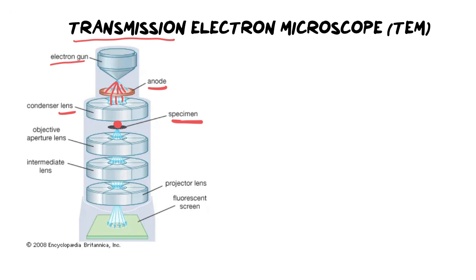And they do that by making a shadow, which is really cool. We see the shadow that they leave behind. If they can't move through the structure, then that area will be black. If they can move through the structure, then it will be white or shades of gray.